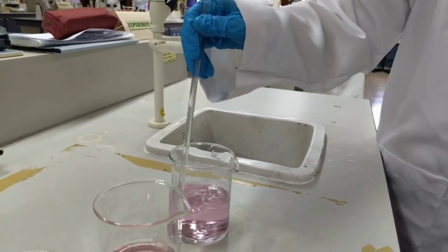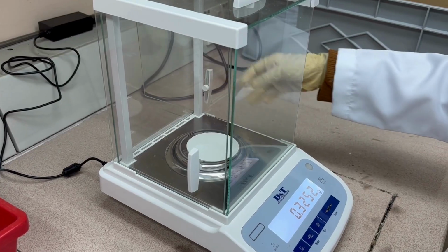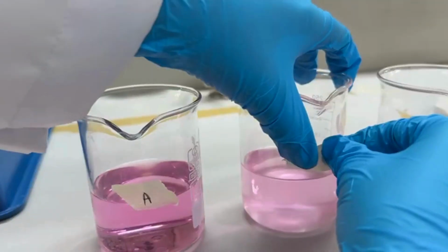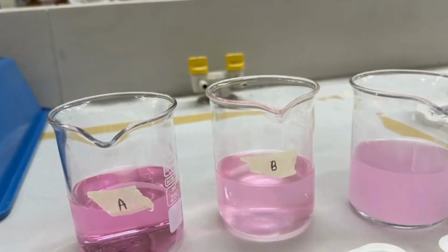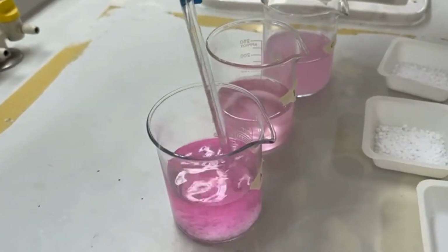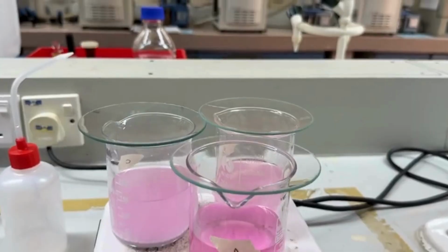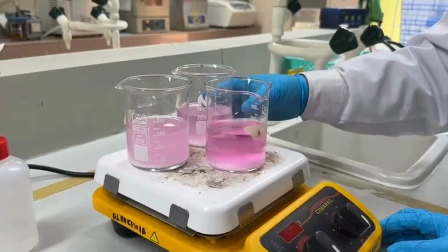Next, weigh the filter paper for the filtrations and the solid urea, about 50 grams, using an analytical balance. After that, label each beaker and add solid urea to each beaker and stir it with a glass rod. Cover each beaker with a watch glass to prevent splattering and minimize evaporation.